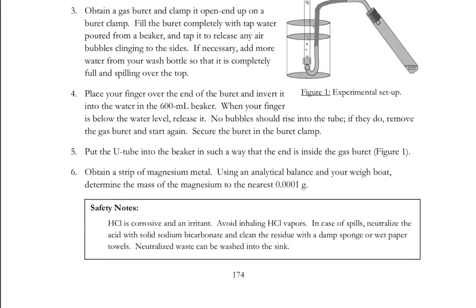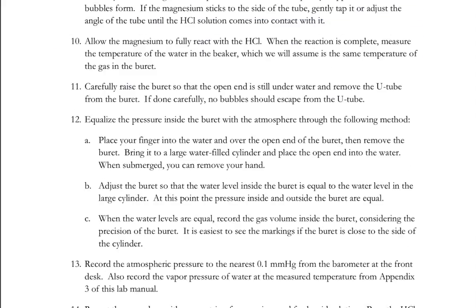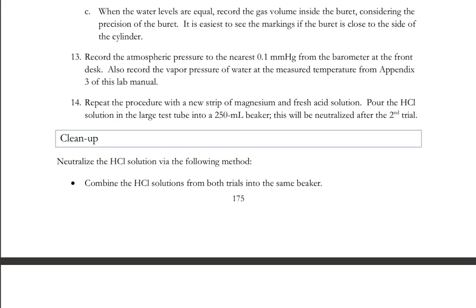So carefully read through the experimental write-up, what the steps are, so that you know what to do, and how we've collected the data when you watch the video.